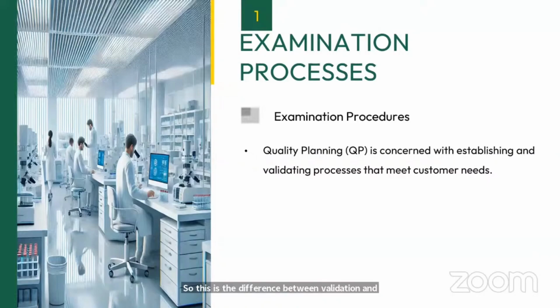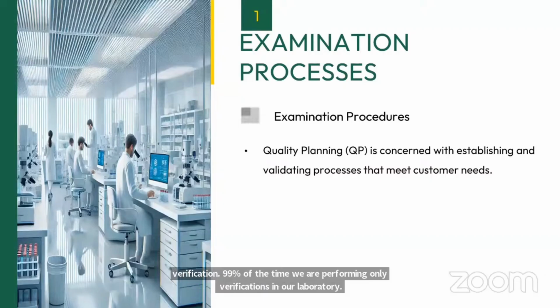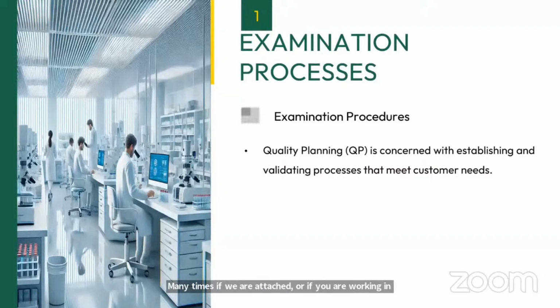99% of the time we are performing only verifications in our laboratory. Many a time, if you are working in some research laboratories, you are developing new tests, then you will require validation. Apart from that, if you are making some changes in an already validated test, so one test XYZ is available, or maybe we'll take the same example from glucose estimation.